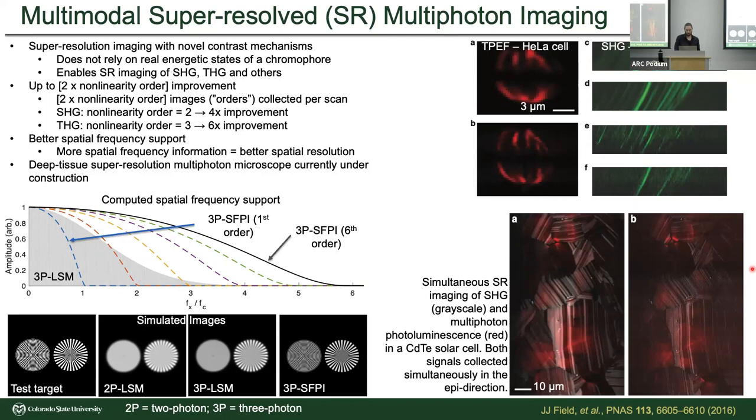I don't know off the top of my head because I have not tried it, but I suspect yes, because as it's stretched, we start to change the organization. My only point of reference for this, we've imaged dura mater, and we have looked at how the SHG signal changes as you stretch that. And I believe that you could, because you would be sort of enforcing organization.